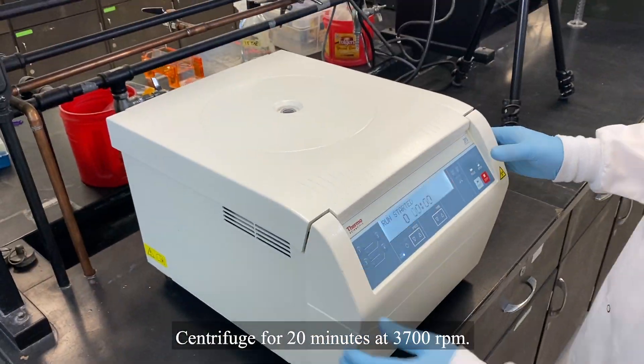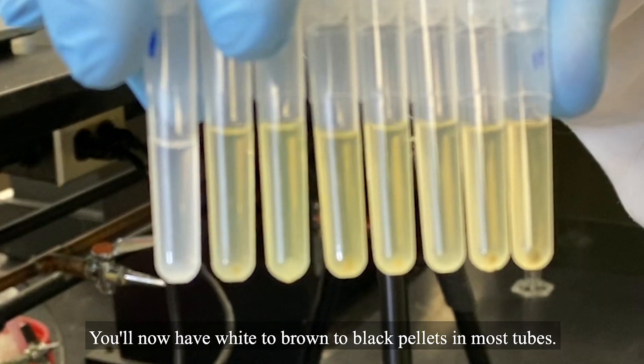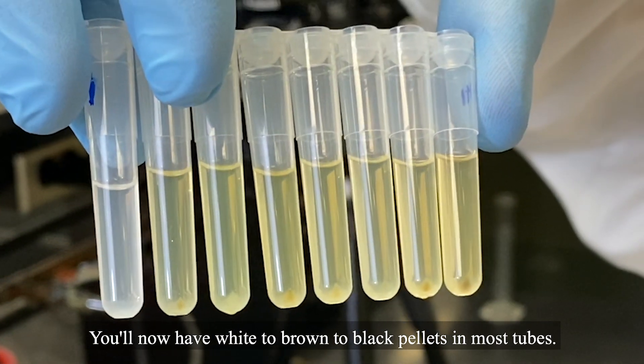Centrifuge for 20 minutes at 3700 RPM. You'll now have white to brown to black pellets in most tubes.